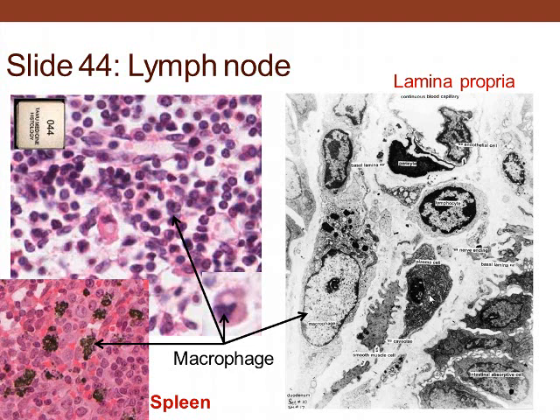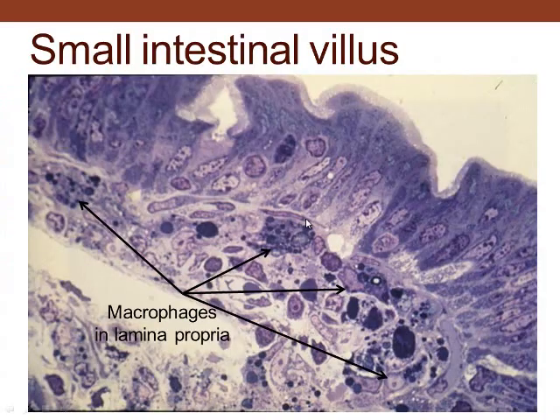Other cells visible here include a plasma cell — recognizable by the nucleus and abundant rough endoplasmic reticulum — and a lymphocyte with a spherical nucleus and little cytoplasm. There is also an endothelial cell lining a small capillary, and another lymphocyte nearby.